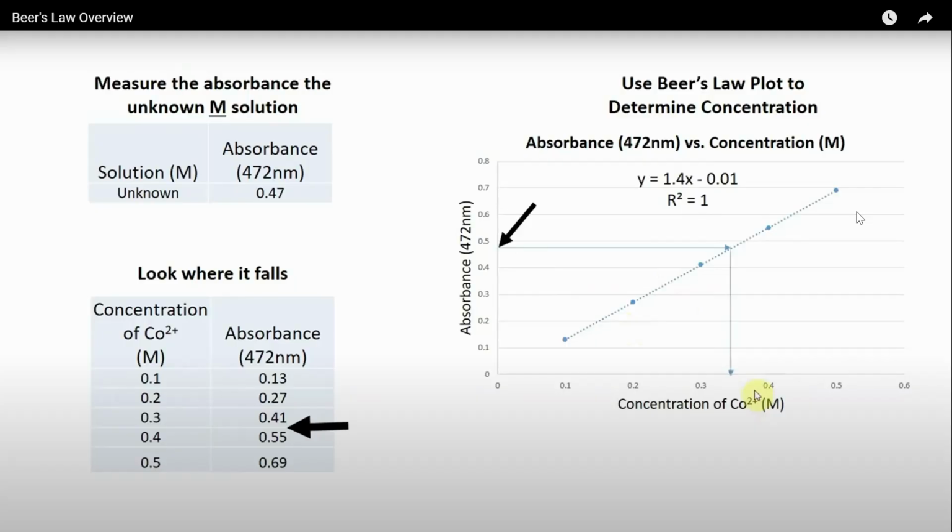Yes? You'll get an absorbance of 0 on the filter if there's nothing in the bag. But you also get a 0 if the shine has red light or red solution. I don't know. That's a really good question. I'll have to look that up. Yeah, the red solution, normal red light, and you absorb all the other colors. You have the red light. You're right on. Theoretically, yeah, I honestly don't know. I'm going to have to go ask a physicist.